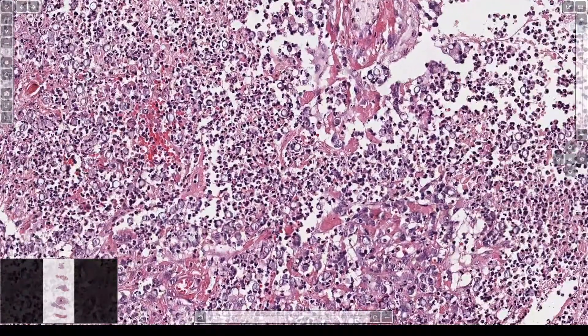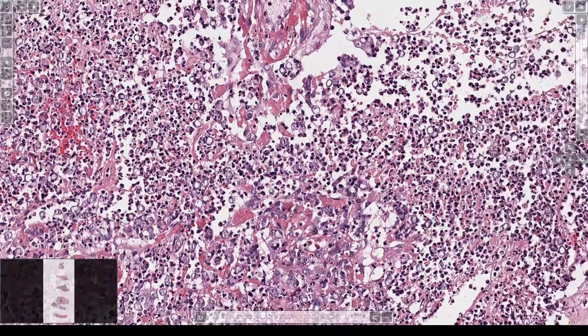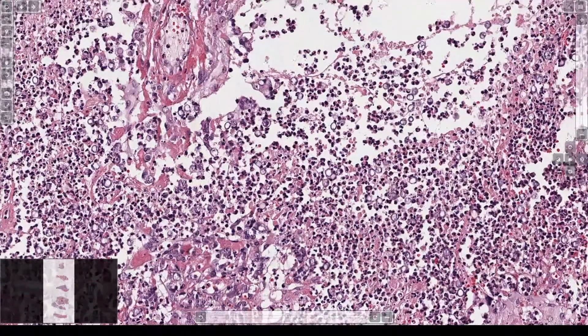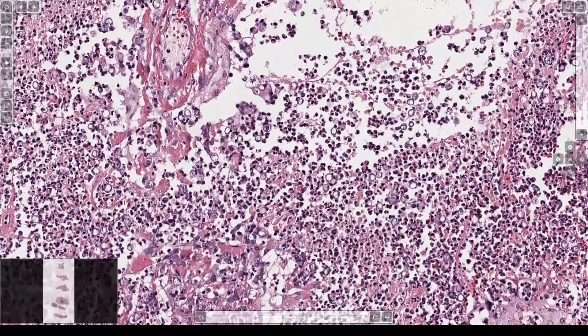These round structures here — these are large, round, uniform yeast. Here's some more. See the little circles? You can see them because they have thick cell walls.